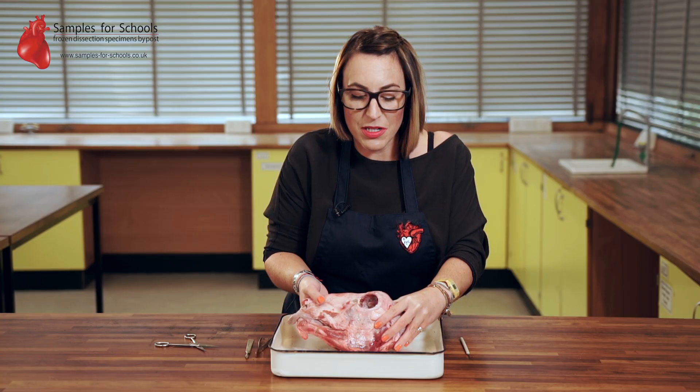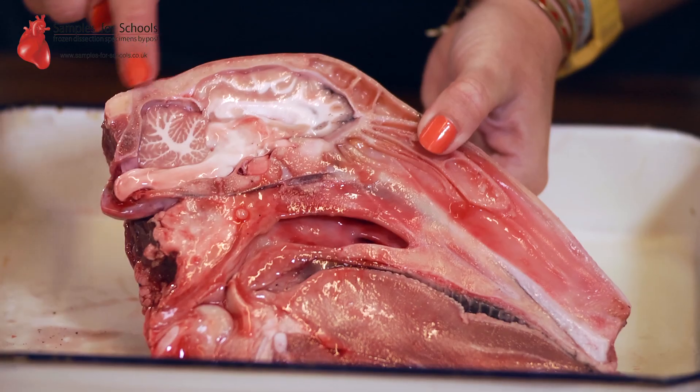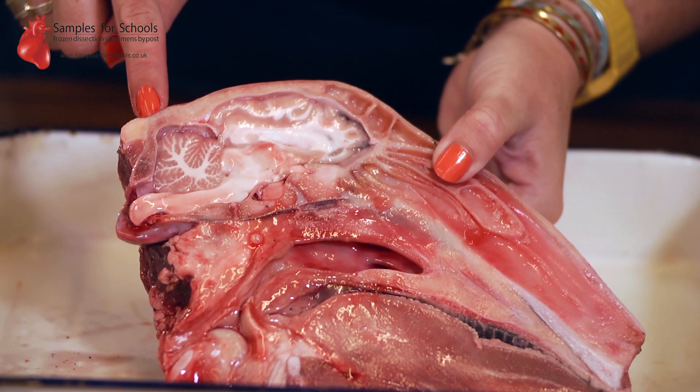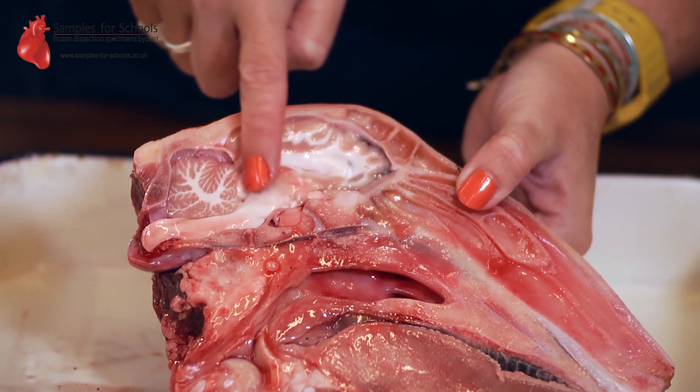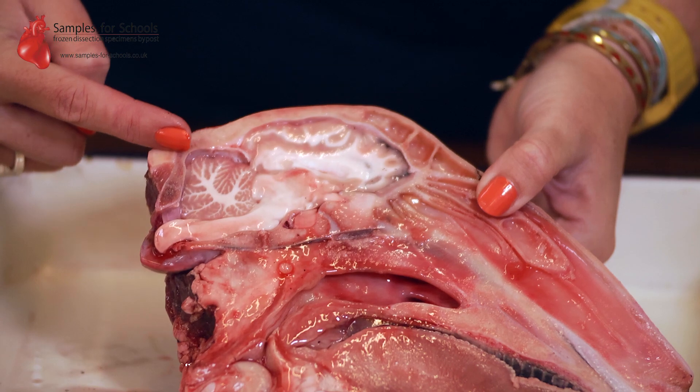On the reverse of your specimen you'll be able to remove the brain. You can see along the edge here the skull of the lamb. This is the main cerebrum area and at the back we have the hind brain, the cerebellum.